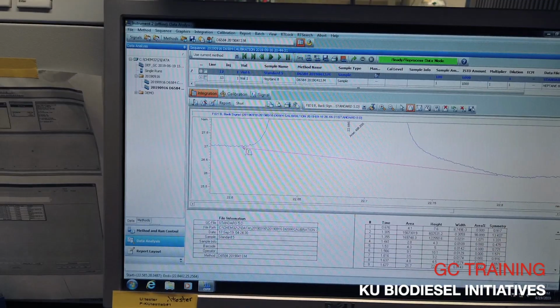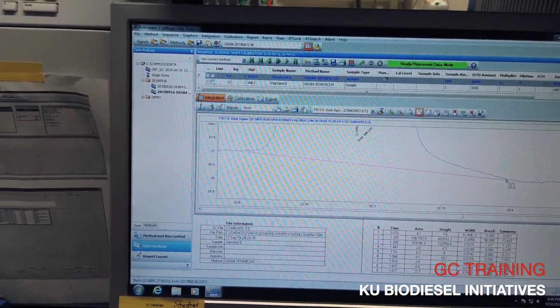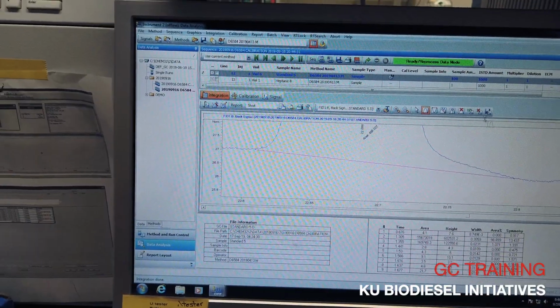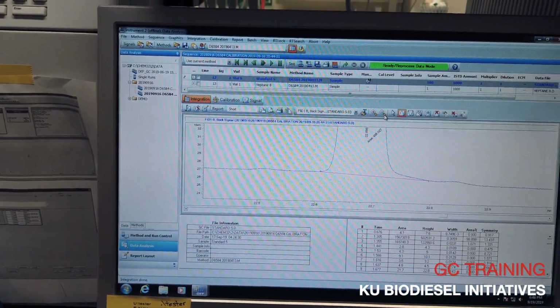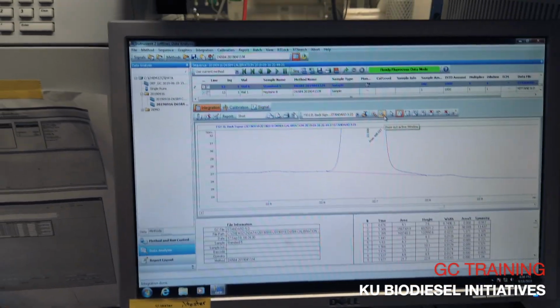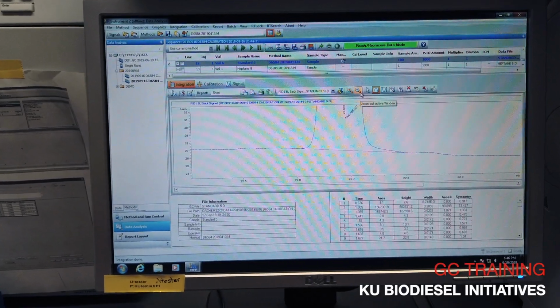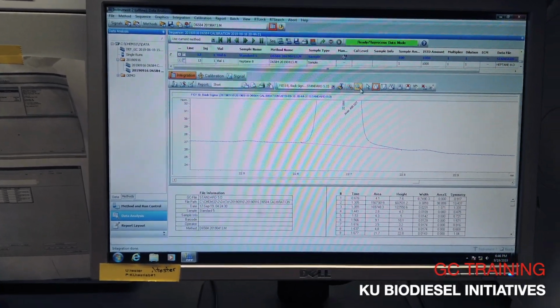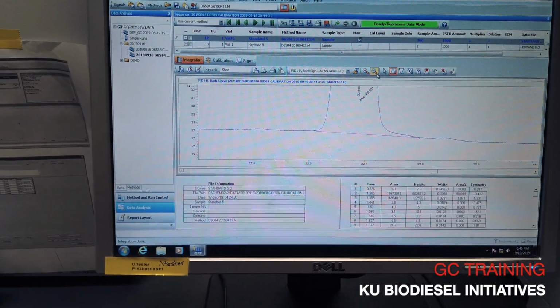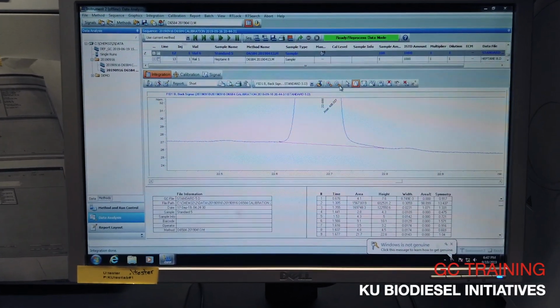I'm only doing that in a specific instance because there's two different ways that it does its analysis. It'll either do a summation of all the peaks that are in the window, or it will pick the largest peak within the window. That's called calibrated peak and sum peak. If it's a calibrated peak, it'll only pick one, but if it's a sum peak, it'll do everything.